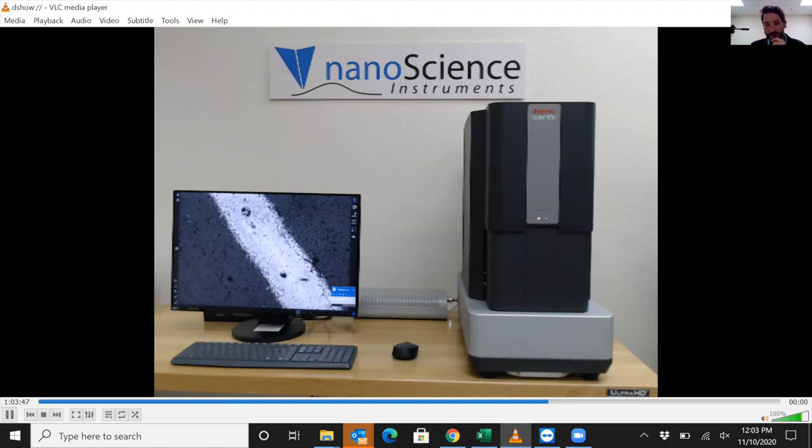So if you think about 1500 hours, that's several years probably, if you're using it a few hours a day, before you actually need to worry about any maintenance. Whereas with the tungsten source, those typically will die in 50 to 150 hours. So it's a lot more frequent for the maintenance. That's another reason it's well equipped for remote access: you're never going to have a catastrophic failure where the system just blacks out because the source burns out. Cerium hexaboride doesn't black out. It'll slowly dull. Maintenance, maybe every 2 to 3 years, depending on how much you're using it, or less if you don't use it as much.